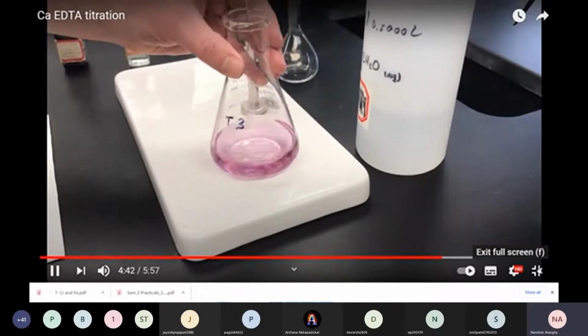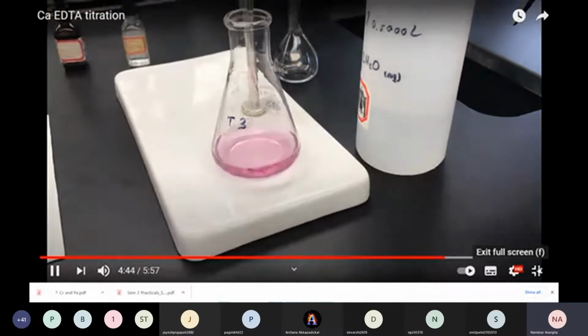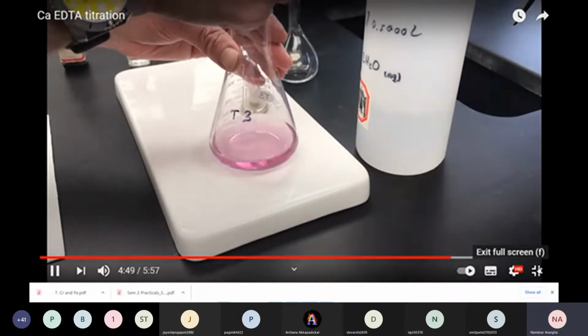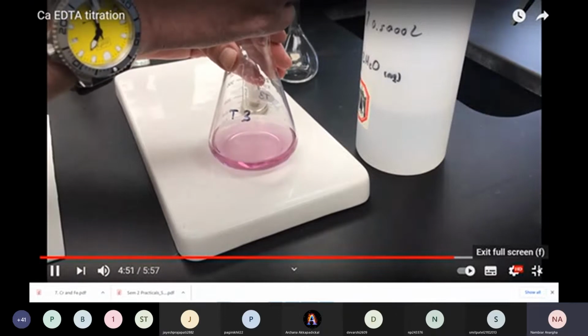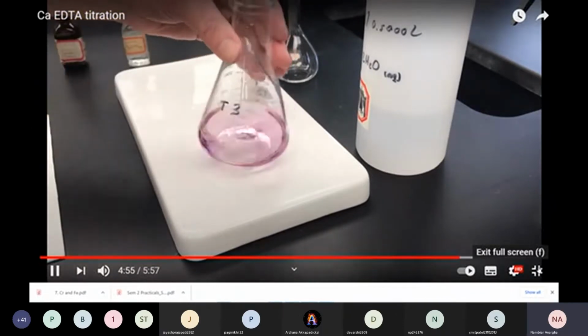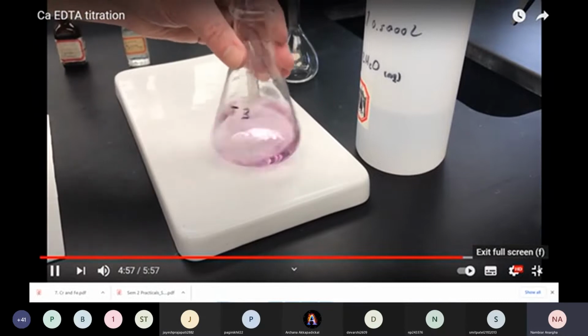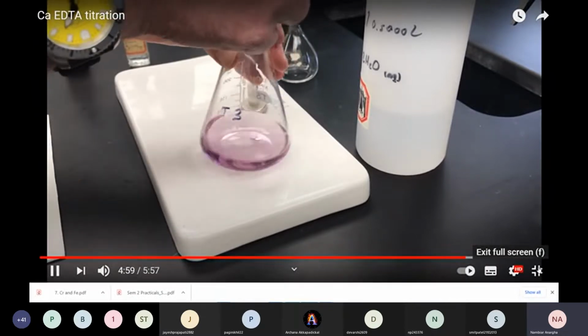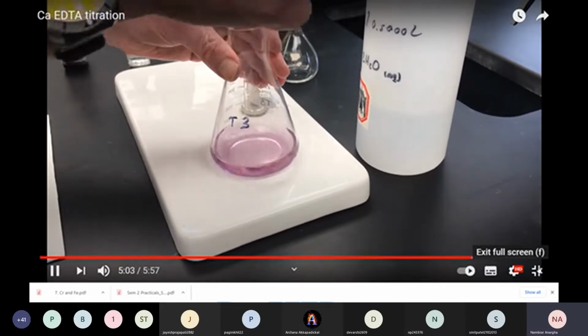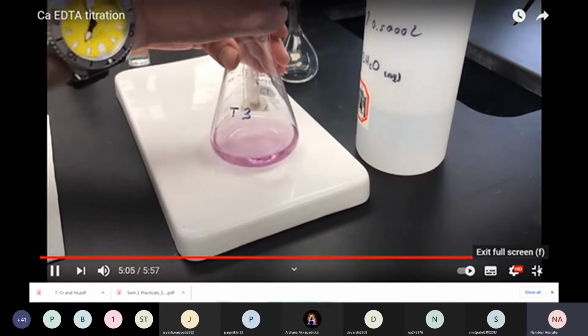Okay, you can actually see that change now that I've gone almost from a pink to more of a purple. So it's a little darker yet, so I'm really going to slow down and go dropwise at this point and see where we end up. There's a drop, so let's see how we look. Perhaps a little bit darker. We're pretty close at this point. I see more purple in there now than I did before, so maybe another drop or two should do it.